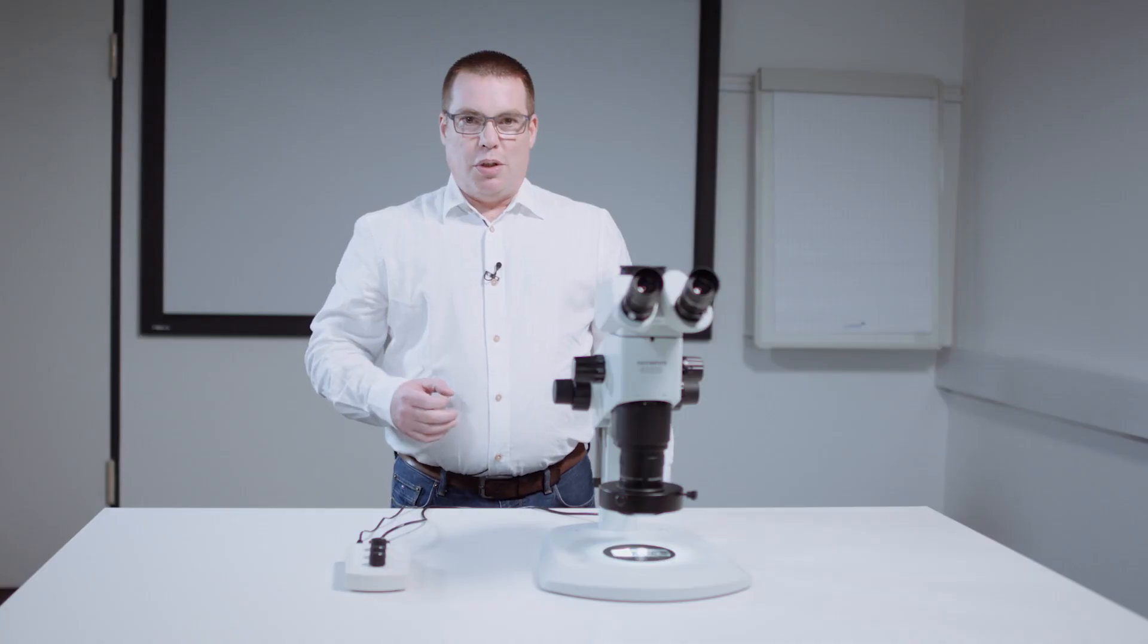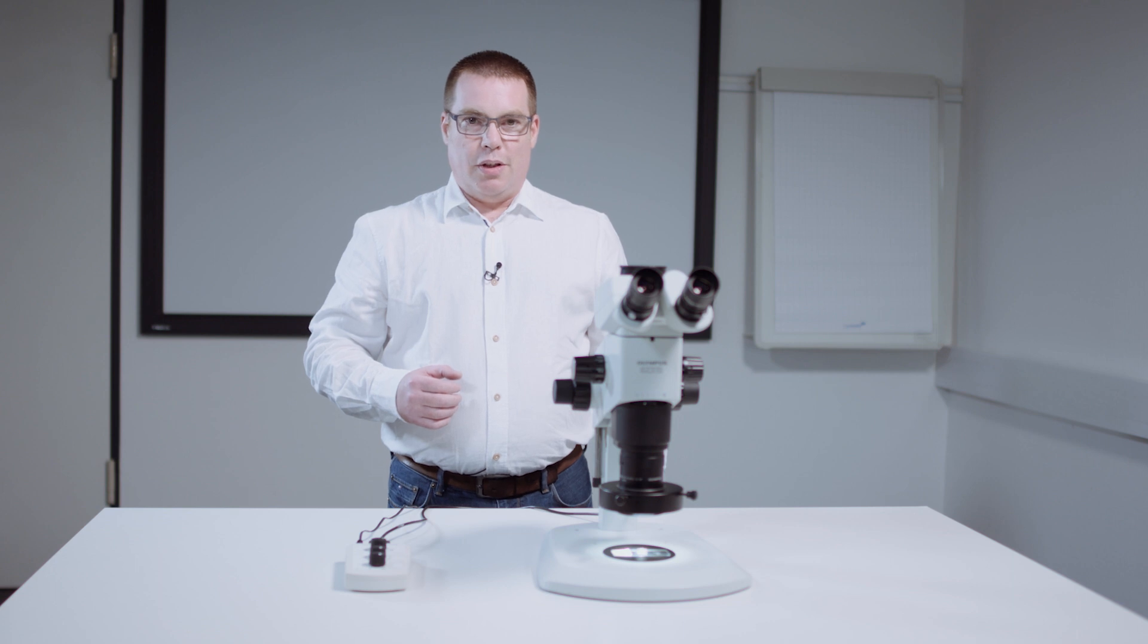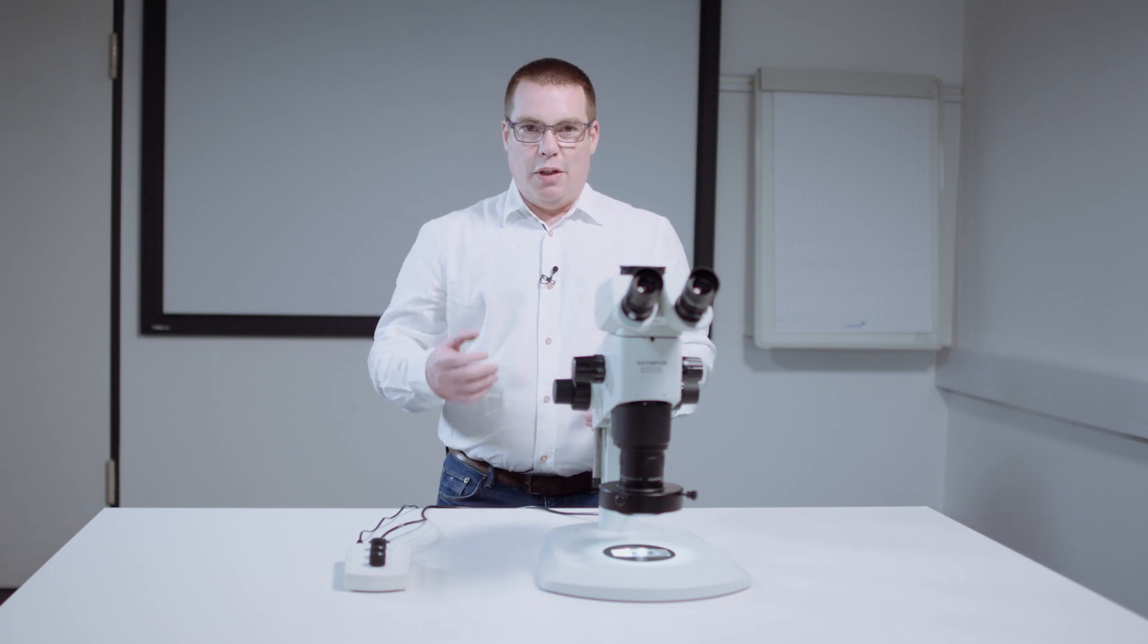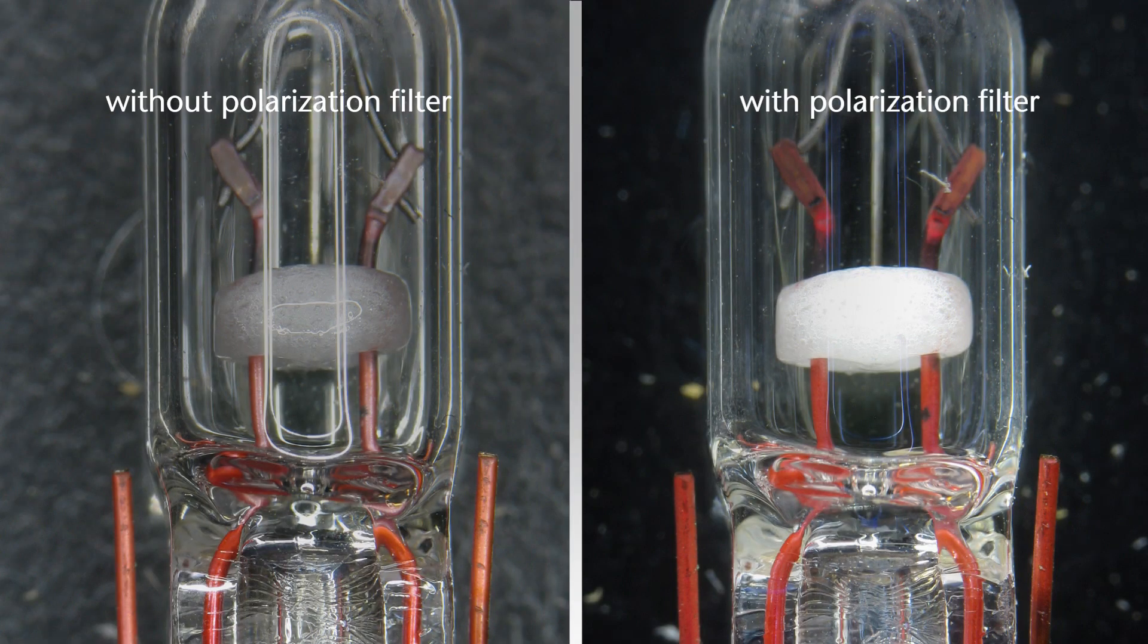Polarization is generally used to reduce surface reflections in stereo microscopy. For example, polarization can be used to effectively reduce reflections on cylindrical surfaces, such as the glass surface of a light bulb.